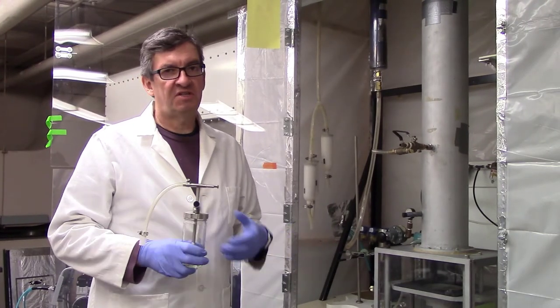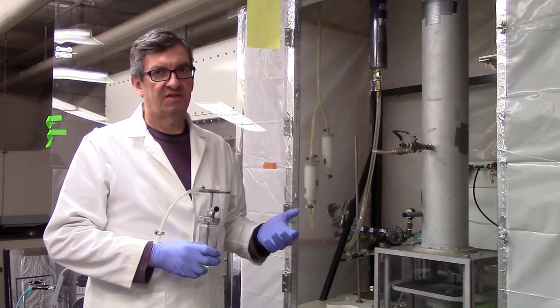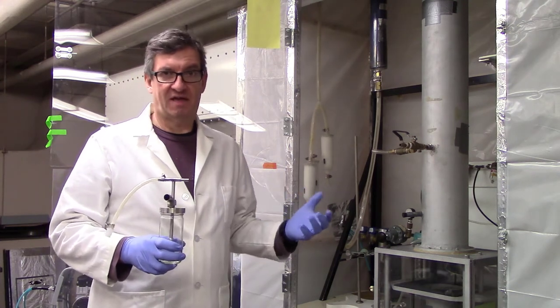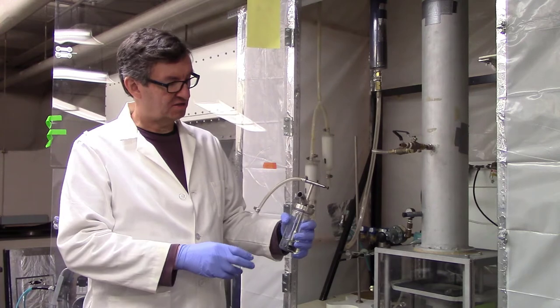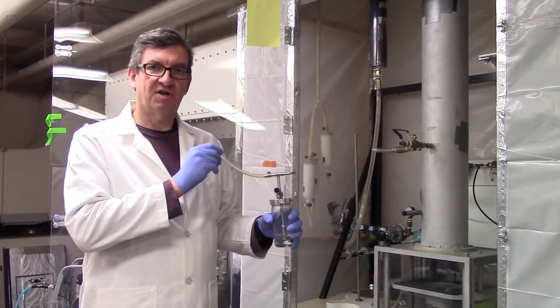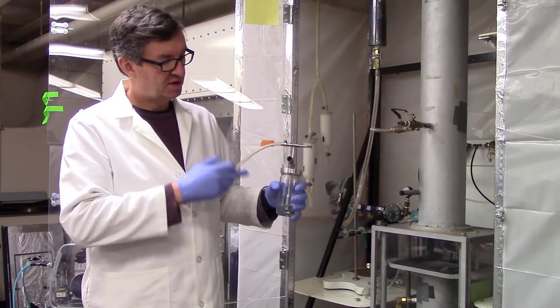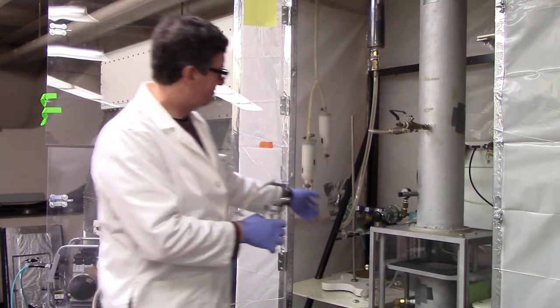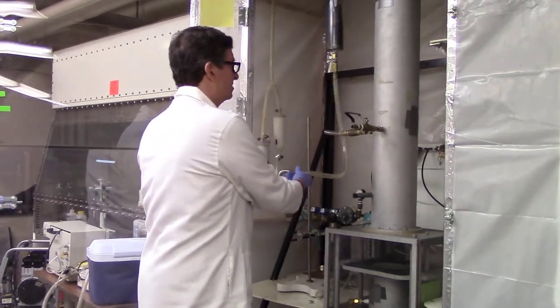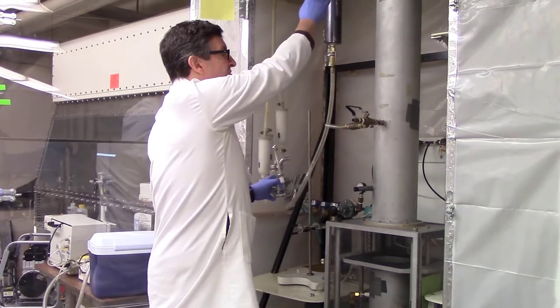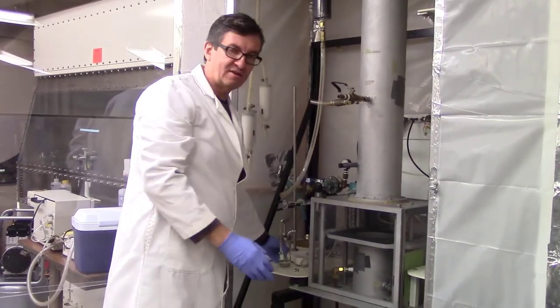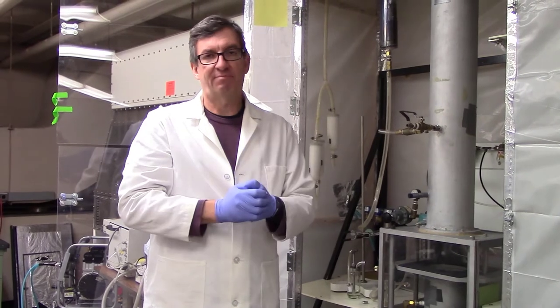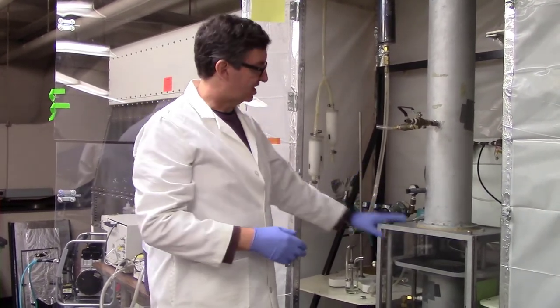So because we study the properties and behavior of different kinds of aerosols in our laboratory, we have to be able to generate aerosols intentionally, and this can create hazards for us. We have devices like this one, this is a nebulizer. We put high pressure air into the apparatus through this tube, and then an aerosol is created that comes out this opening. We can place the nebulizer into this apparatus, and the aerosol flows through the apparatus. Air is moved by a vacuum pump, and we can conduct different tests using different types of air samplers to try to understand how they perform, maybe even test filtration media to see how effective they are.